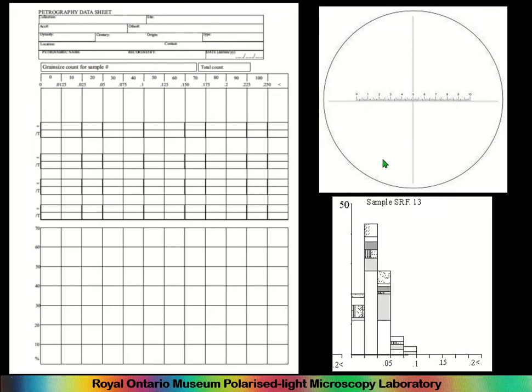So the objective of doing this is to come up with a graph, and I've always made these block diagrams. A thing about the blocks is that they're very clear. You can do interesting things to look at the minerals, diversity within it. Not very statistically valid, certainly not as valid as the actual grain size distribution itself, but still quite informative.